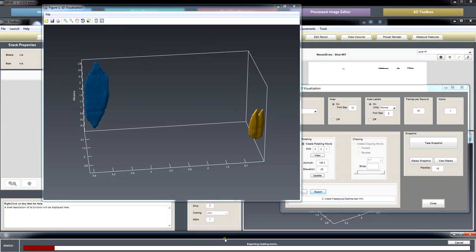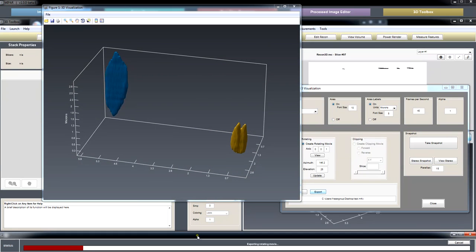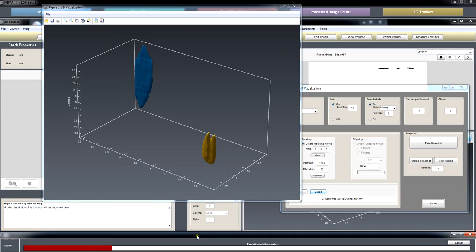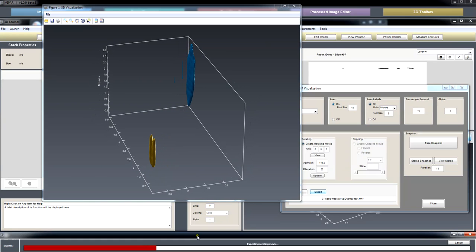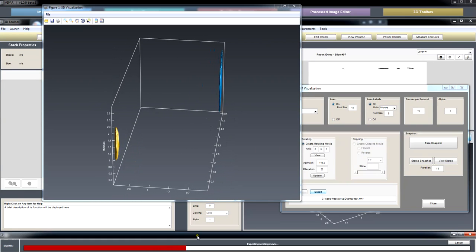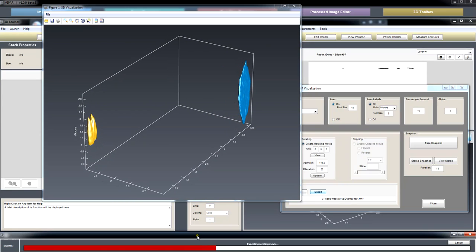It is, but we can work on that. Just about everything, actually. It's one of the more operating system agnostic formats that is also compressed. I haven't had any issue opening those on Windows or Macintosh.